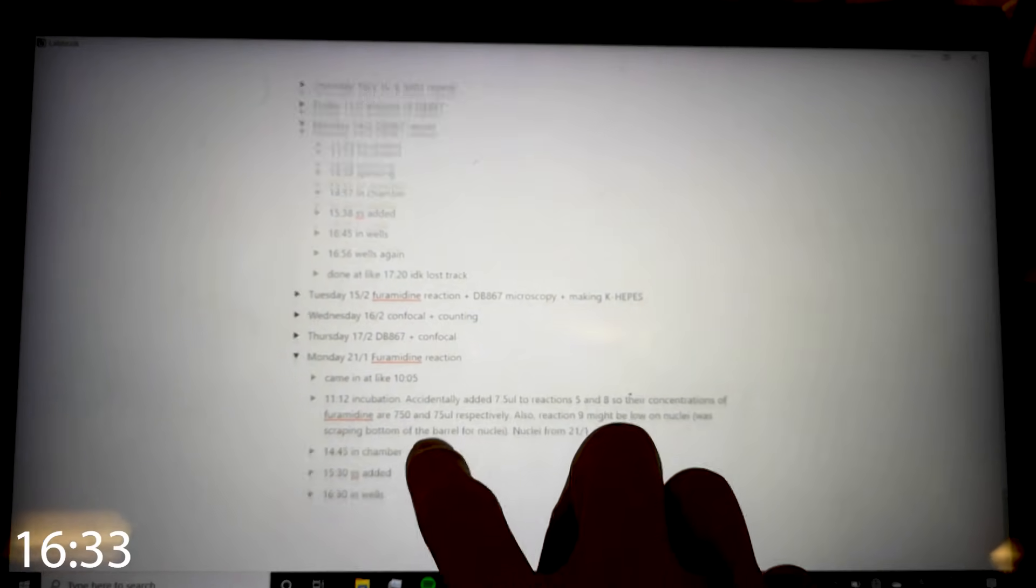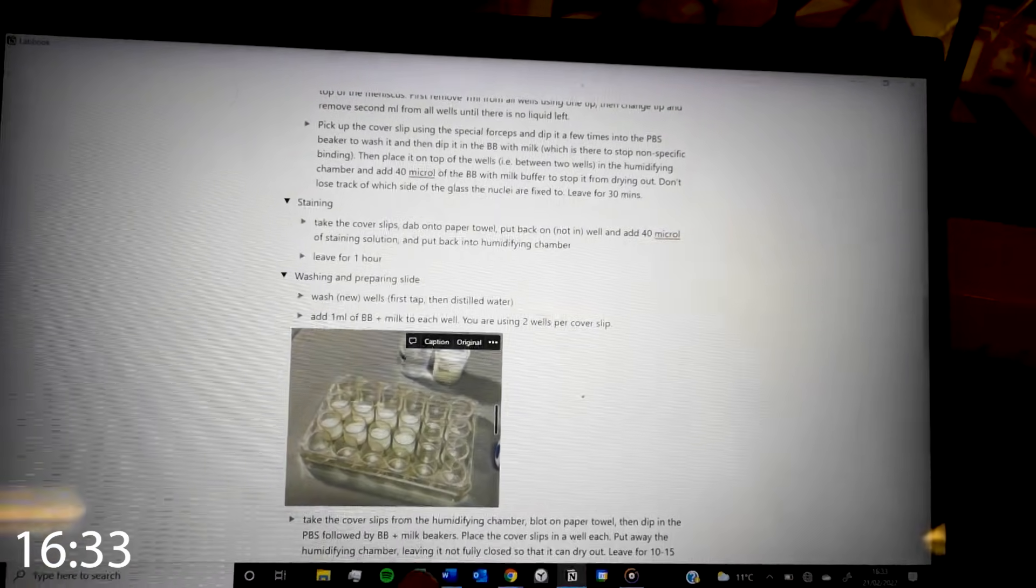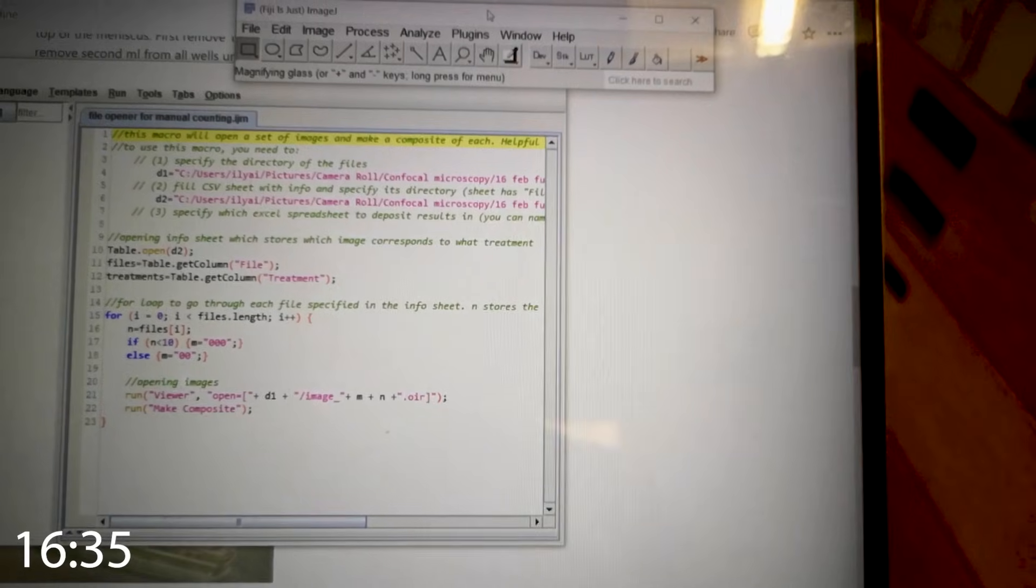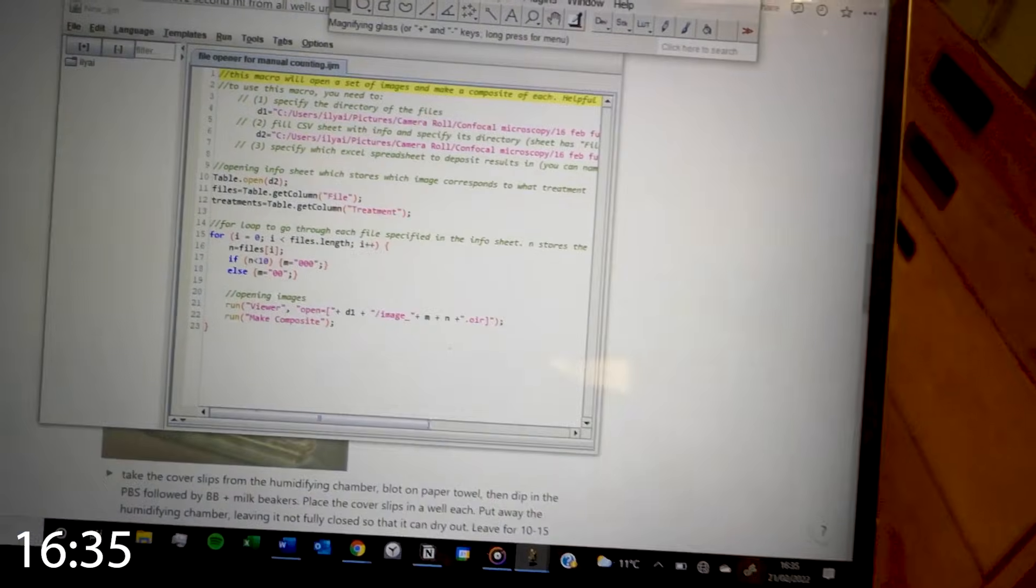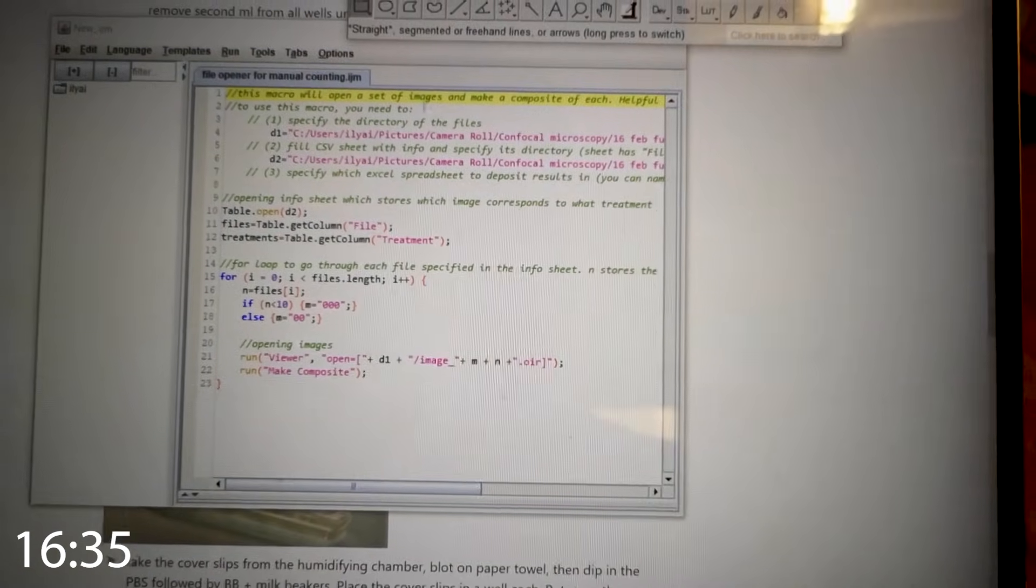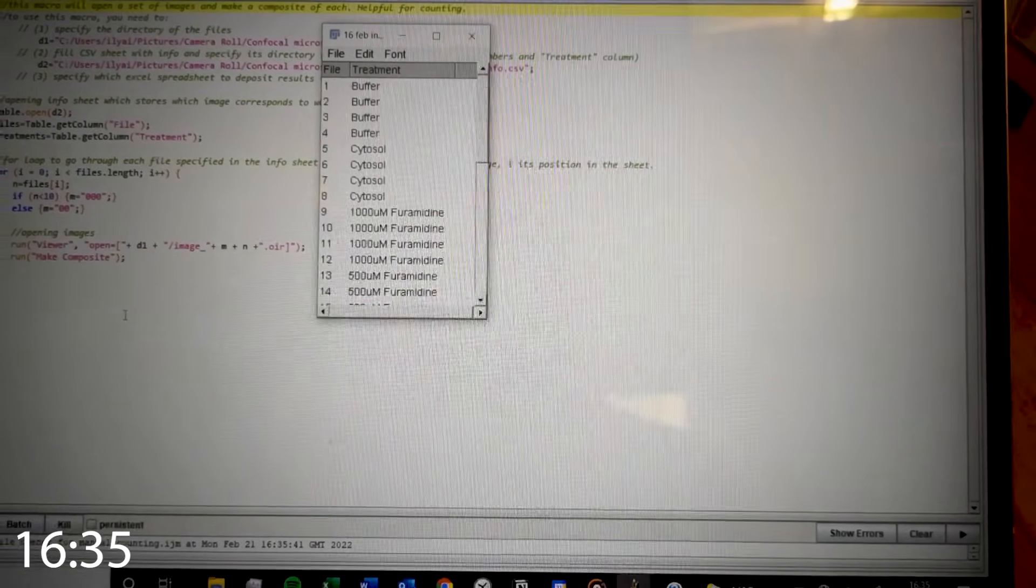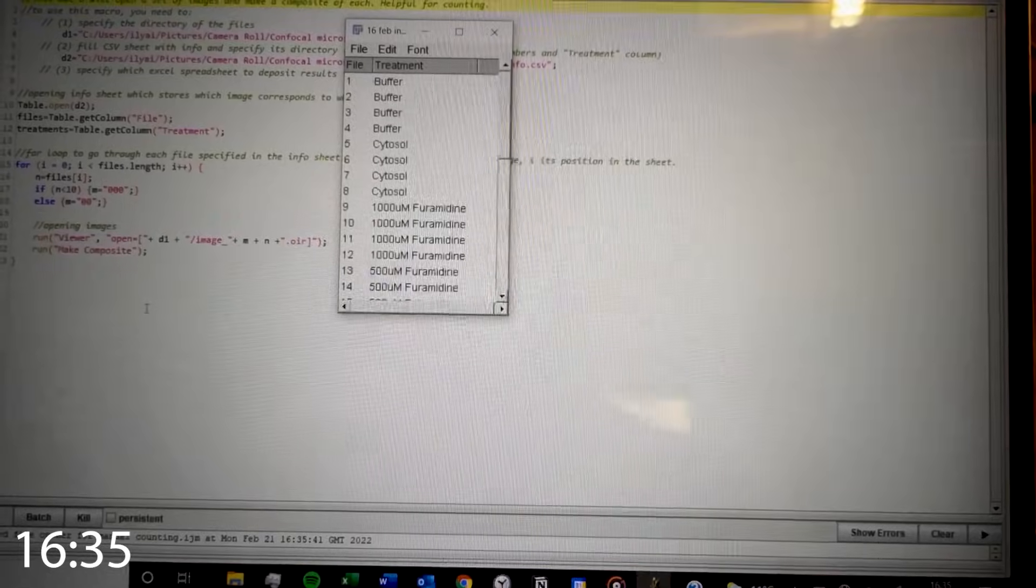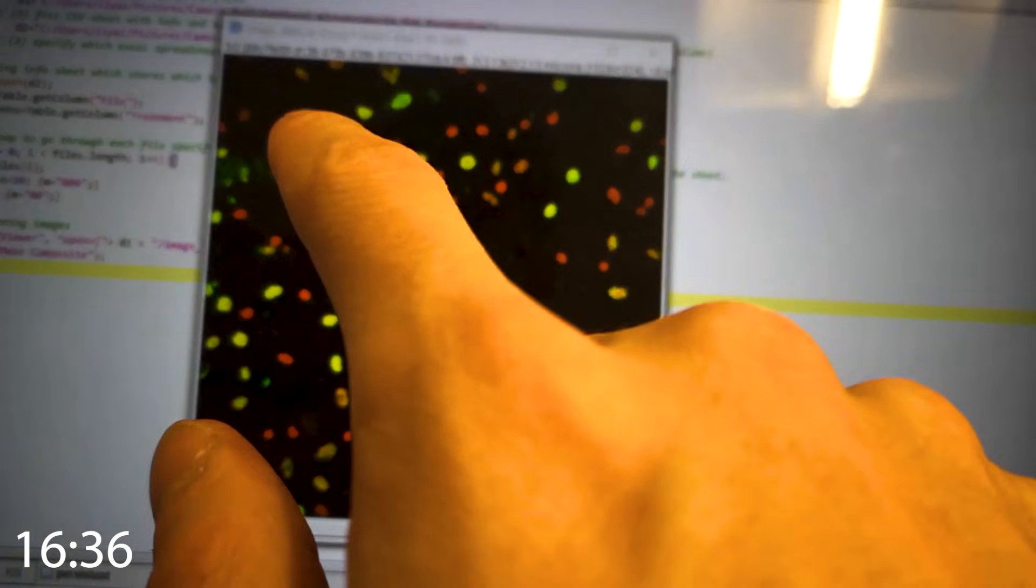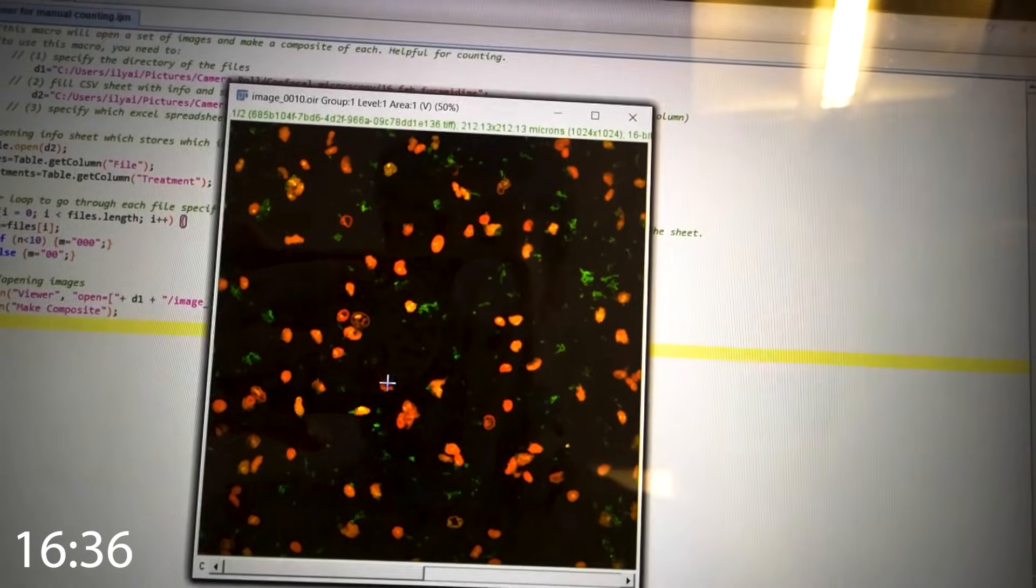I'm using Notion as my lab book, keeping track of like when I do what, and then I can scroll back and see what the protocols are for different things. And I also have a pipetting plan on Excel, so I know how much to put in each test tube, and how much of what, and I've got a helpful plot as well. So the results I get from all the work I'm doing is images taken on a fancy microscope, and I analyze them using this software called ImageJ. And what I can do is write a script here, which opens all the files I want. So I'm going to run it, and then it's going to open a load of files. I did the code wrong and it's not working, this is very embarrassing. So these are the kind of results that I get from all the work I'm doing, and it's showing nuclei, so like the brains of cells, and you can see different colors depending on how much DNA replication there is.